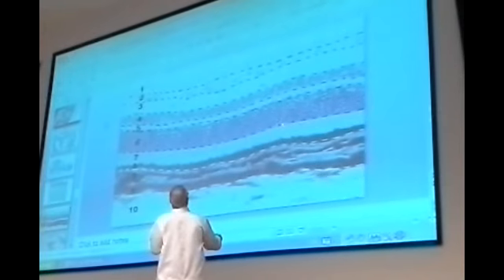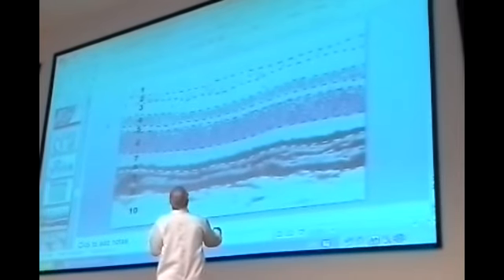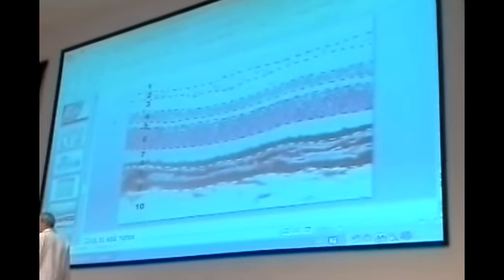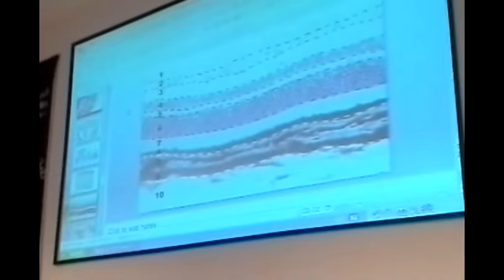This is the outer nuclear layer. Outer plexiform. Inner nuclear layer. Inner plexiform. Ganglion cell layer. Nerve fiber layer, and then the inner limiting membrane. Okay. What are the layers of the choroid? What are the contents of the choroid? It is vascular, pigmented connective tissue. Okay. What is the function of the pigmented epithelium for the retina?